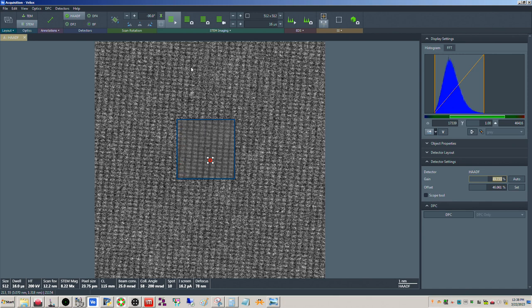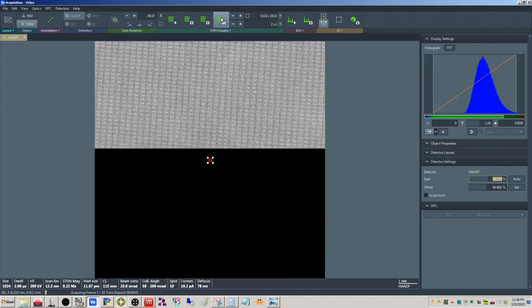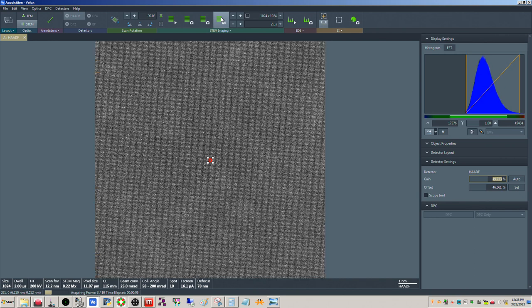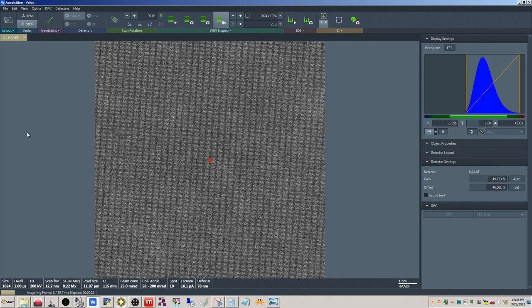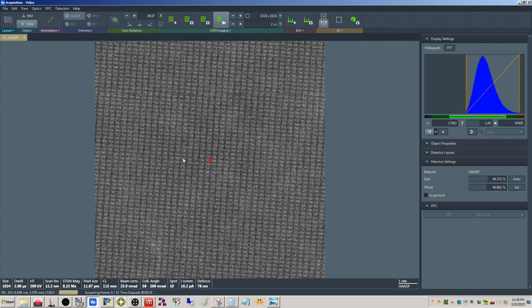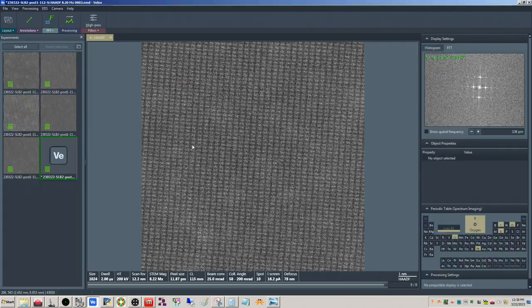Okay, let's go ahead and do it now. Yeah, it's much thinner here, as you can see. Basically I'm seeing mostly a direct disc and not really strong Kikuchi diffraction. At 300 kilovolts, that might not be as much of an issue, but let's see what we got here.